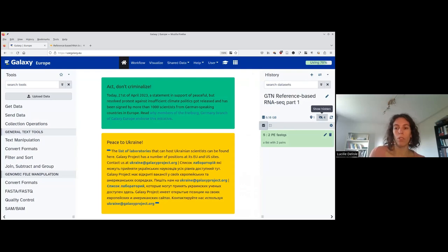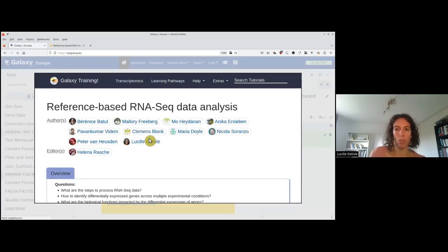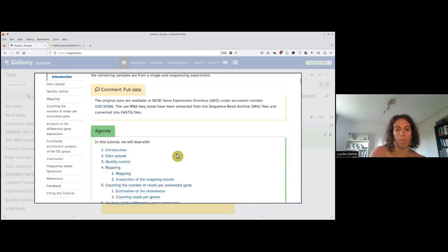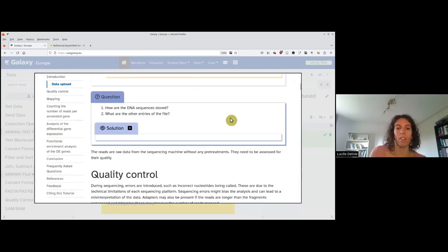You may ask how do I know how to rename the datasets? Everything is written in the tutorial. So if you miss a step, just don't forget to go to the training material. You can see the instructions: create a paired collection named 'two paired FASTQs', rename your pairs with a sample name followed by the attributes. During the tutorial, you may have some questions and you have the solutions — some of them I will do with you, but some you can do by yourself.